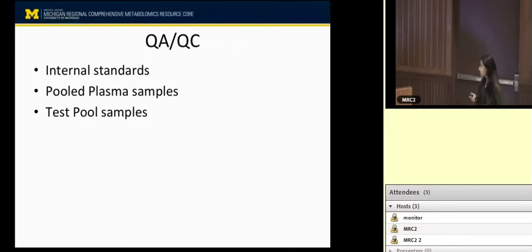And keeping this information in mind, we take the experiment design into consideration and randomize these samples before we put it into the mass spec for the run order. And tomorrow, I think George is going to talk more about this randomization and design. I think Anna has also touched a little bit on why it is important to do this kind of randomization before you run these samples.